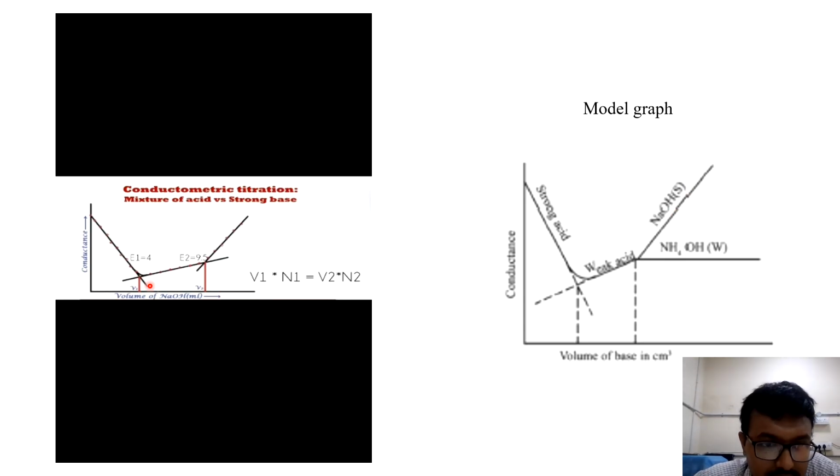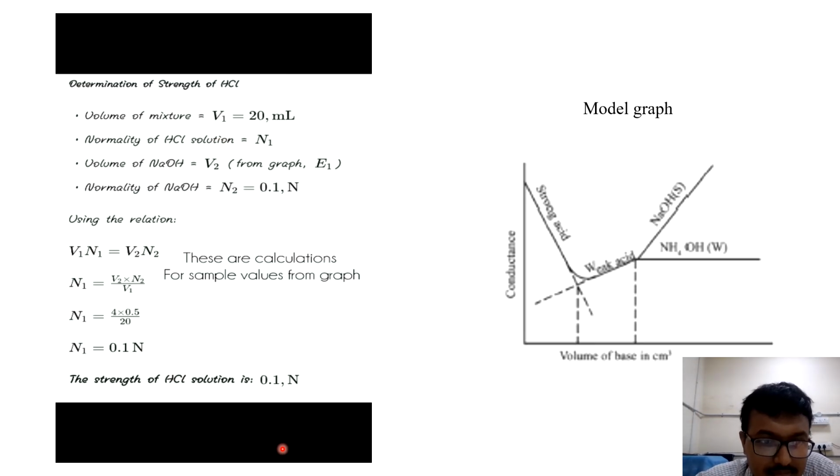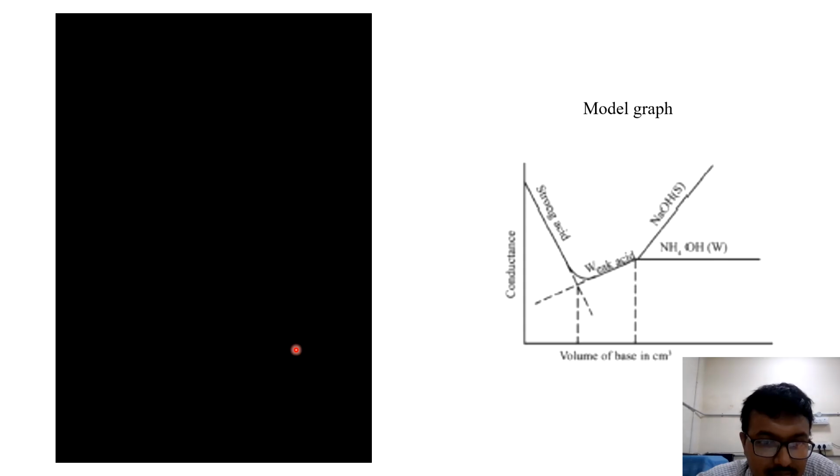We can calculate the acid strength using the formula. So this is the calculation part. Okay, so everything was described in this video. Now I will explain you.